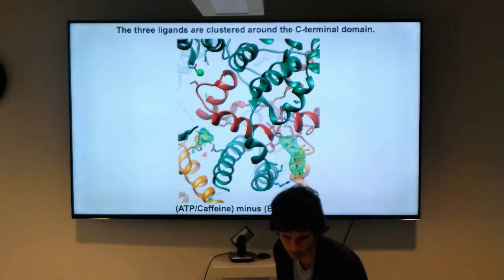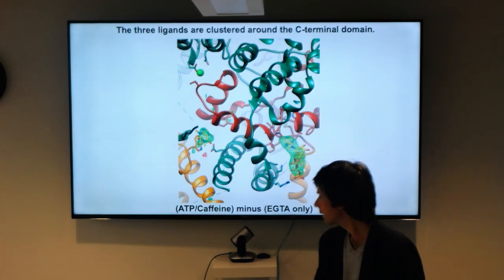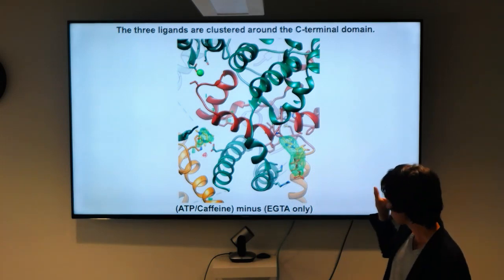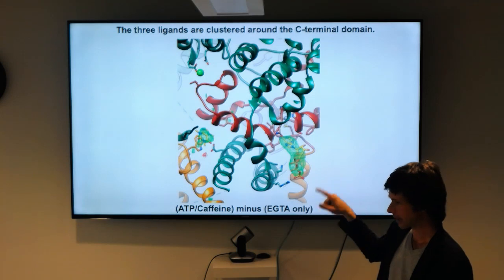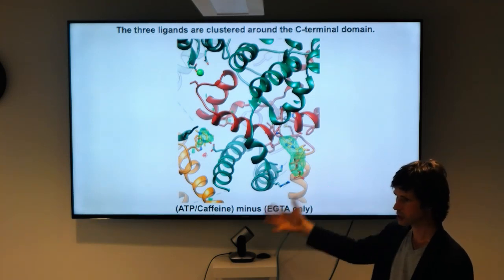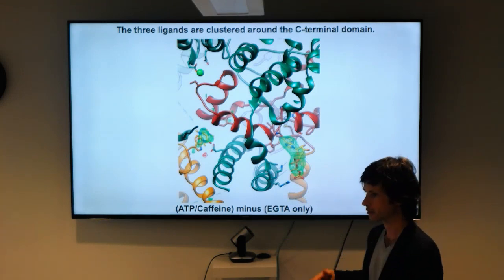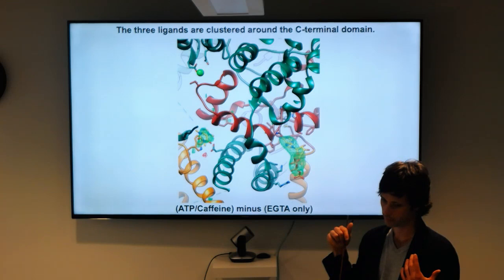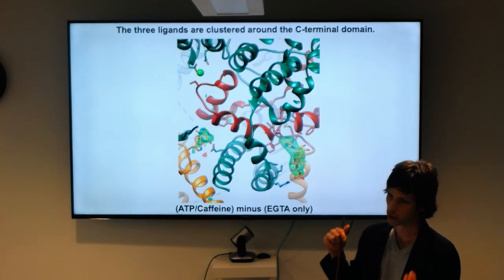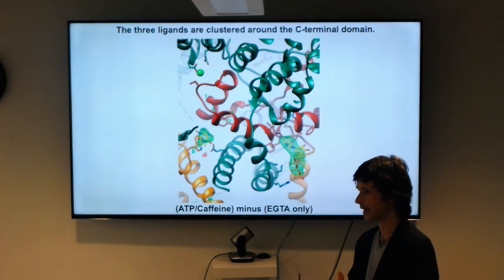And when I say locally aligned difference map, what I'm referring to is basically you can do this in Chimera. You take a sphere of density around your ligand binding site of interest, extract it out from both structures, align them, and then subtract those. The reason for doing that is to decouple any changes in the orientation of the domain that binds the ligand from that process.